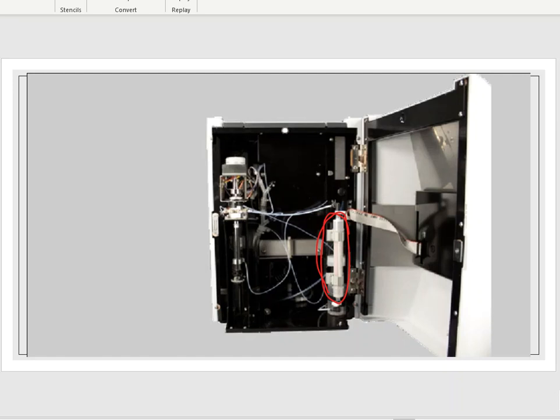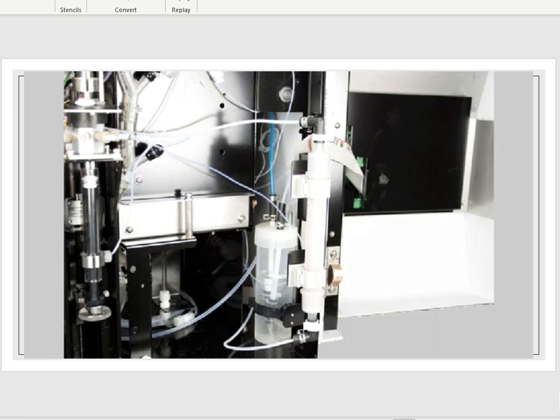All right. Now that halogen scrubber is meant to be up front, is meant to be easily accessible, because this is something that you have to change maybe again on a regular basis, depending on the types of samples that you're running and that you're analyzing. Again, I can change the picture on you. You can maybe see this a little bit better. It's just from a different angle. I've zoomed in a little bit. This is actually the same picture that we used to talk about this piece, right? And that piece was called the humidifier. And the halogen scrubber is actually right here in front of it.